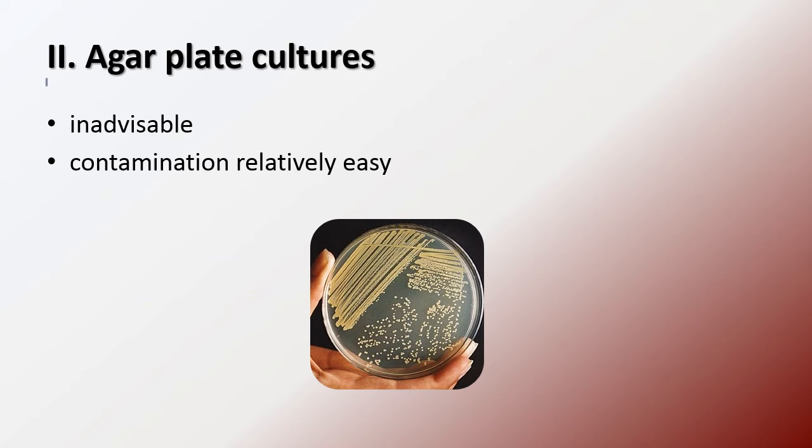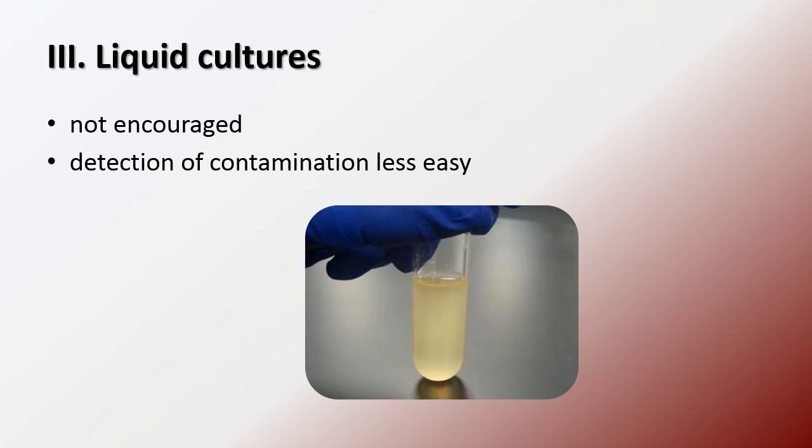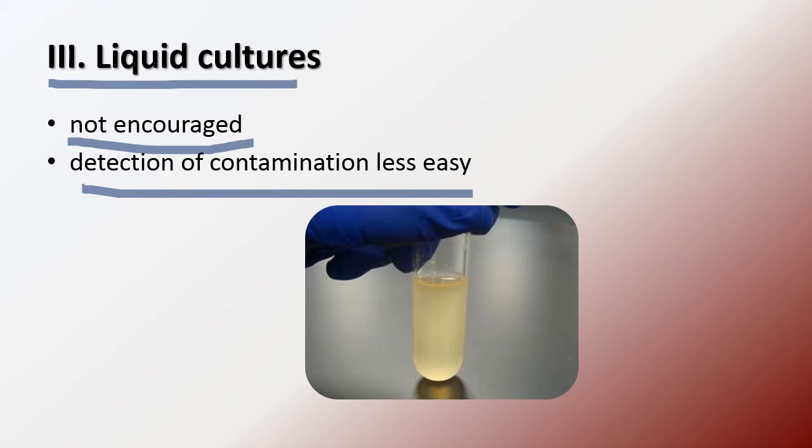Okay, some researchers also use agar plate cultures to maintain and preserve bacteria, but it is highly inadvisable, and the main reason is that contamination can easily occur in the agar plate. Some researchers also use liquid cultures to maintain and preserve pure cultures, but again, this is not encouraged because the detection of contamination is not easy in liquid culture.